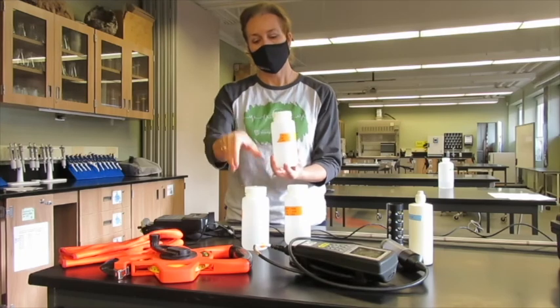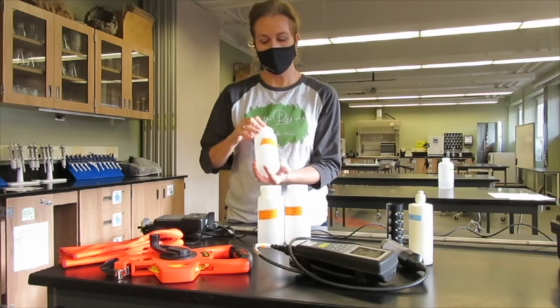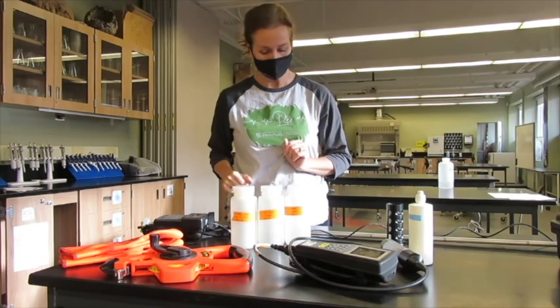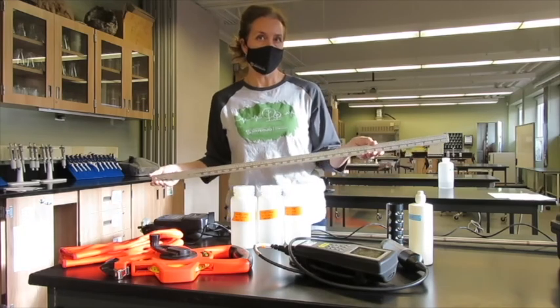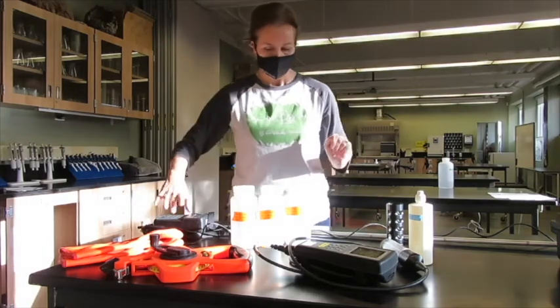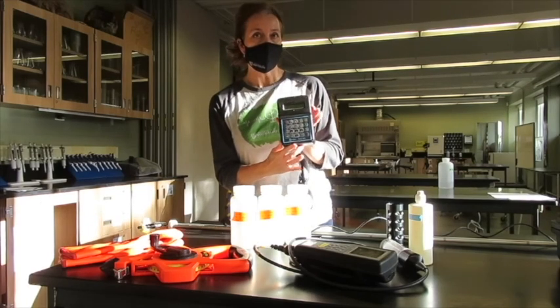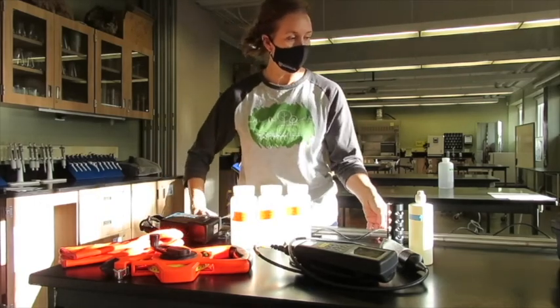Labeled water bottles — it is important to add the date, your stream name, and sample number. A meter stick. We have a swaffer — this is a swaffer flow meter that measures both stream flow and discharge.